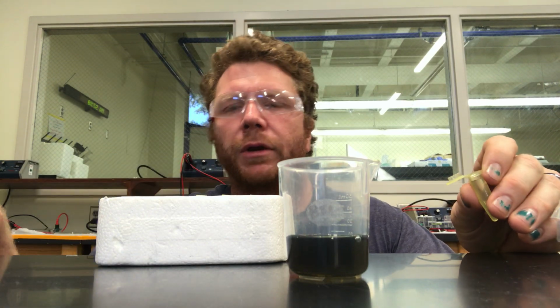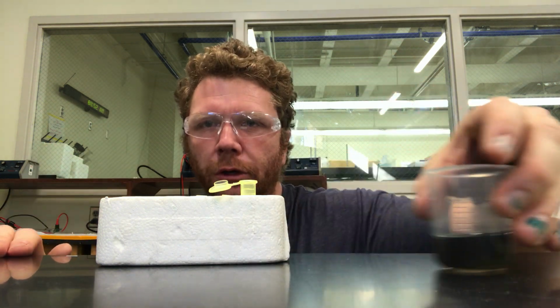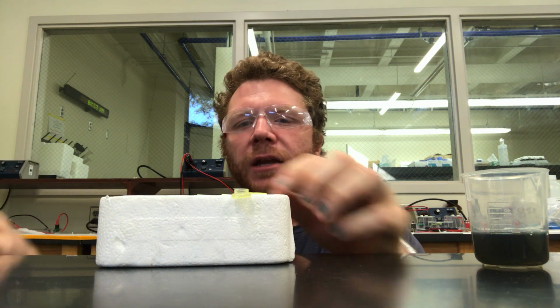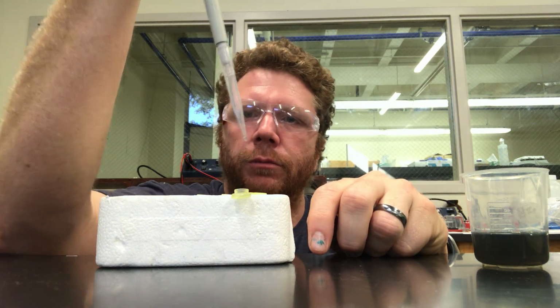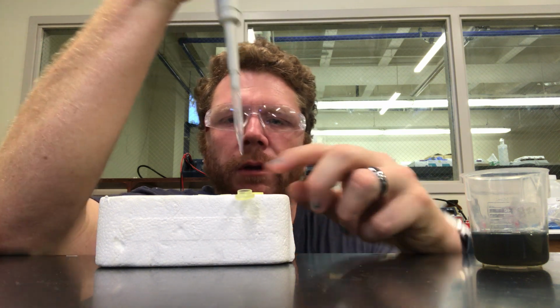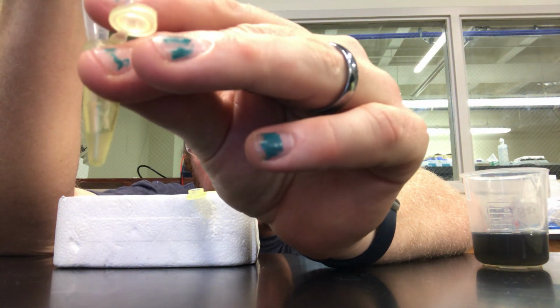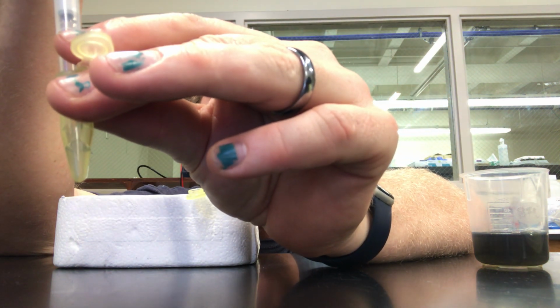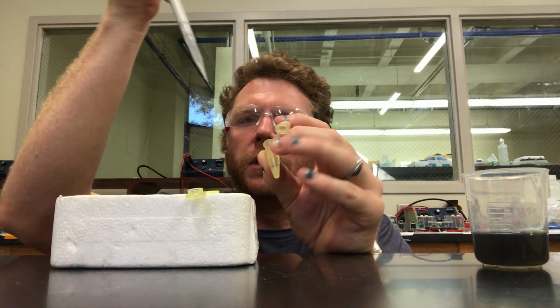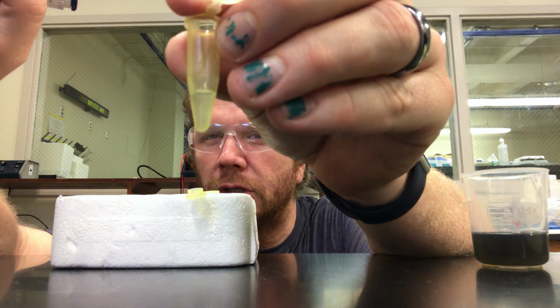After I've collected 100 microliters of protein in that microcentrifuge tube, I'm going to get an equal volume of deionized water in another microcentrifuge tube, and I'm going to transfer that to my first microcentrifuge tube. So I'll take 100 microliters of deionized water, add it to 100 microliters of my known protein sample. I'm going to pipette that up and down a couple of times to thoroughly mix it. Then I'm going to have a total of approximately 200 microliters in this microcentrifuge tube.